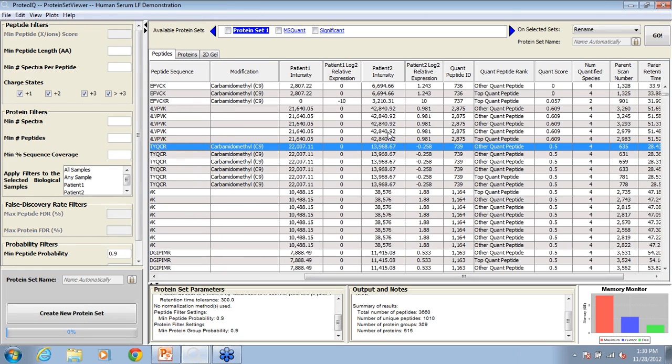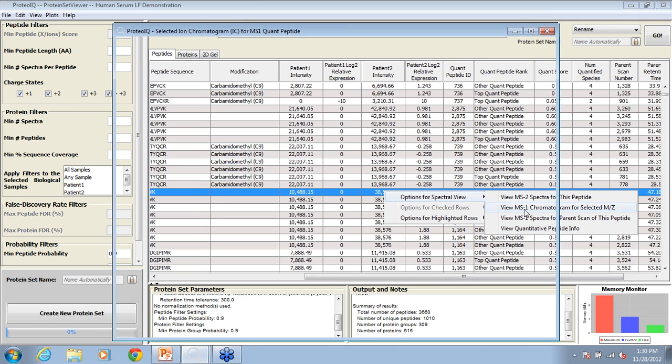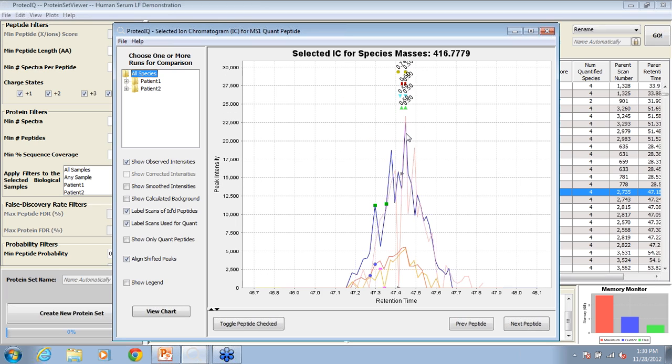Right. On the extracted ion chromatogram, jump in here. You'll now see that that's also displayed near the precursor dots, showing you which precursor scans were picked for quantitation. I'll zoom back out. You want to turn that off and hide that. If you have a large number of groups, sometimes it can get kind of jumbly. We'll likely be changing how these are organized in a later release, but right now this is what we have. If you want to turn that off, you just click Label Scans, and they'll disappear for you. Okay, so then you don't have to worry about them.